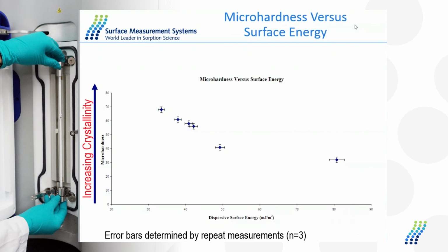I think I did see another question about using nitrogen as a carrier gas. We can use nitrogen as a carrier gas now. All of our new instruments by default are shipped with nitrogen. If you have an instrument that is with helium, you would have to contact us about changing it over to nitrogen. Some of our older instruments, depending on the exact model, we used a few different vendors of mass flow controllers. There are 2 different pathways. One requires new mass flow controllers to be installed, and one requires just some different gas correction factors. So you'd have to contact us.